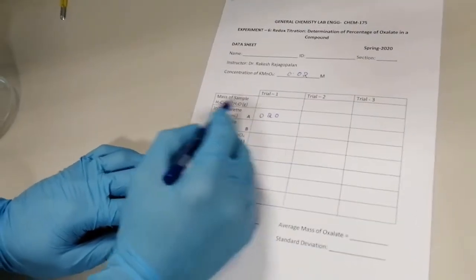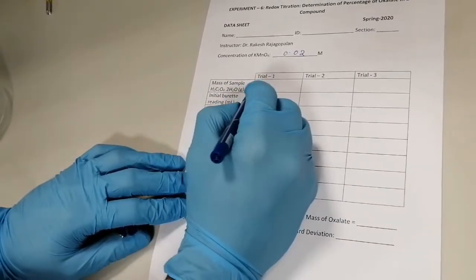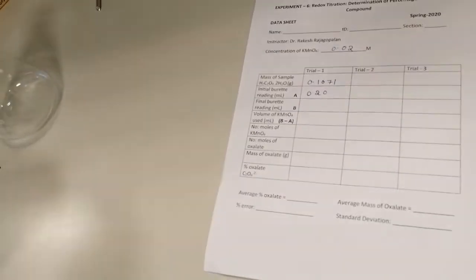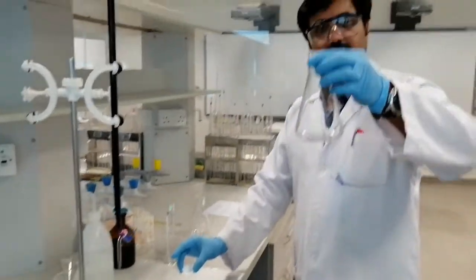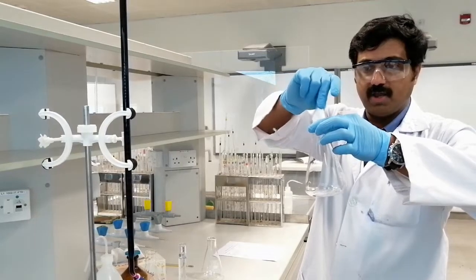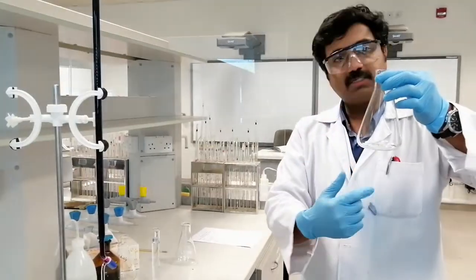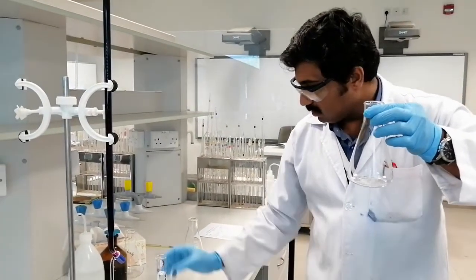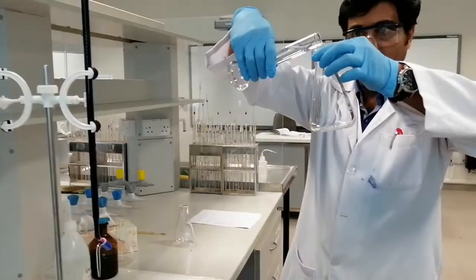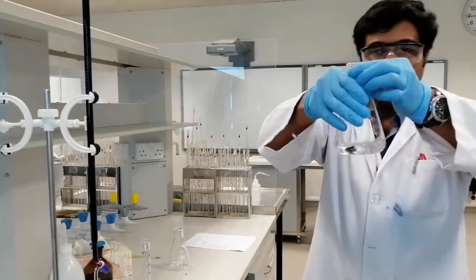The sample is oxalic acid with two molecules of water of hydration. I'm going to transfer the oxalic acid crystals to the Erlenmeyer flask — please make sure you transfer all the crystals from the weighing tray. Then I dissolve the oxalic acid in 50 mL of one molar sulfuric acid solution, which I measured in a graduated cylinder and transferred into the flask.